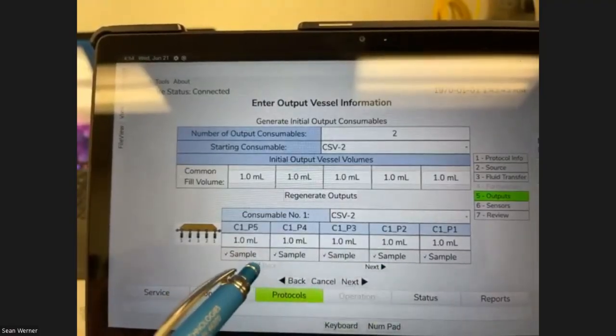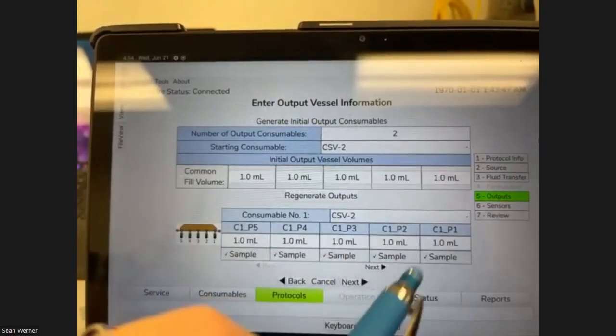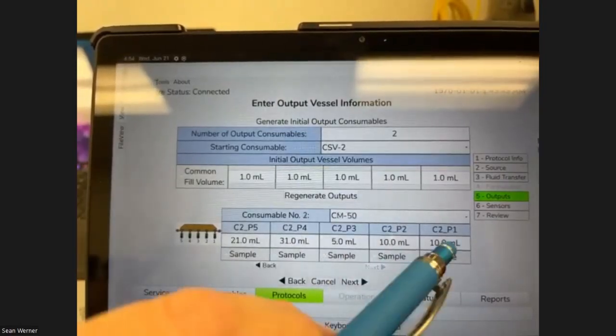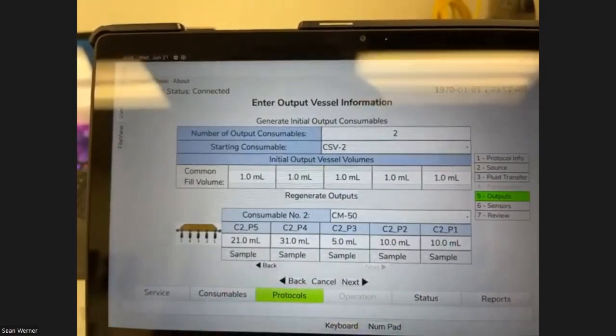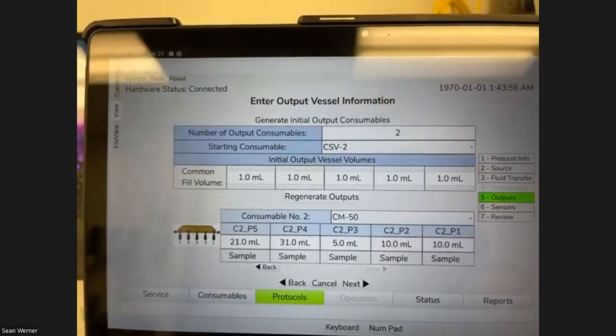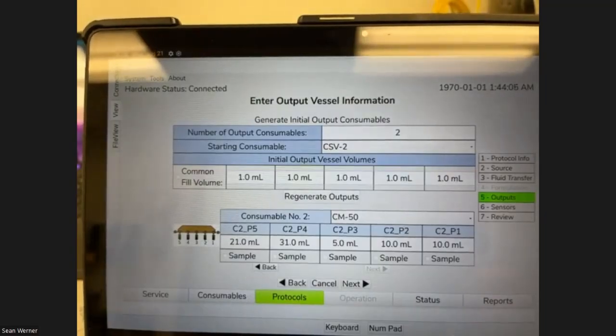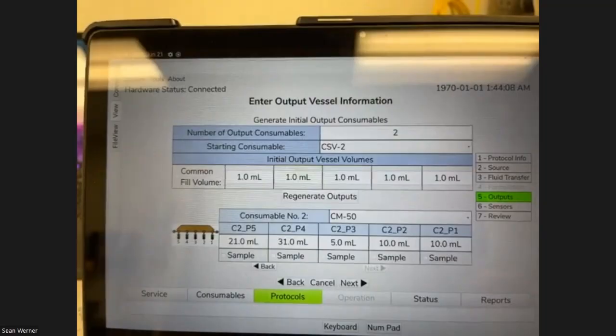So I went back to the first one with the vials and clicked sample so that that'll give me the slower flow rate. Whereas on the bags, we've got the higher one. Quick question though, if we were using the cell seal vials that have the weldable tubing, where you're increasing the distance on there, would we also need to change the volume, or does it just push air through after it gets a certain volume in the line to do the fill?